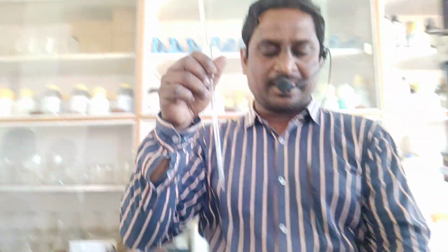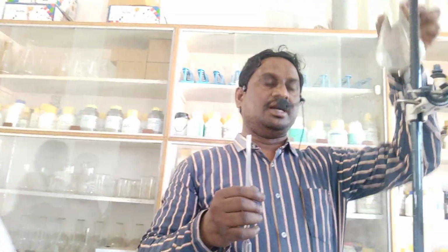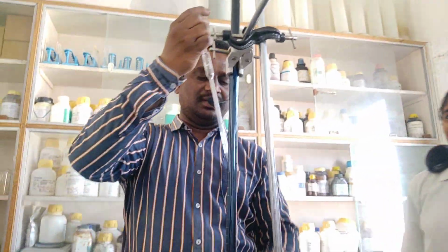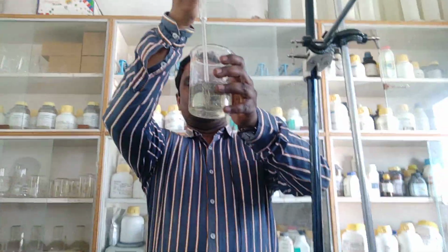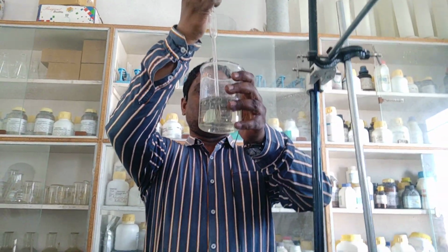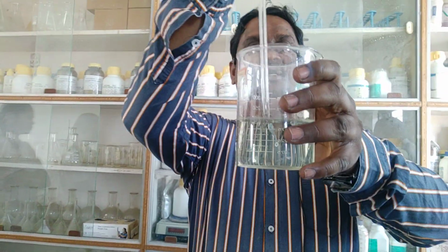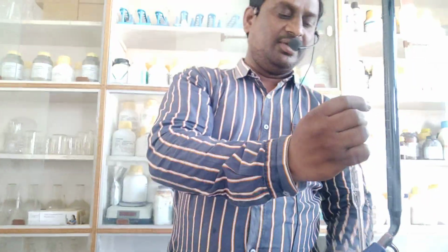See the procedure: pipette exactly 10 ml of FAS solution into a conical flask. So this is the conical flask. What we have to do? 10 ml. We have to suck this one. So I am taking this FAS solution and keeping the pipette here. Don't keep the pipette down at the bottom, children. Just at the top layer of this FAS solution only you have to keep it. And see carefully, what do we call this finger?